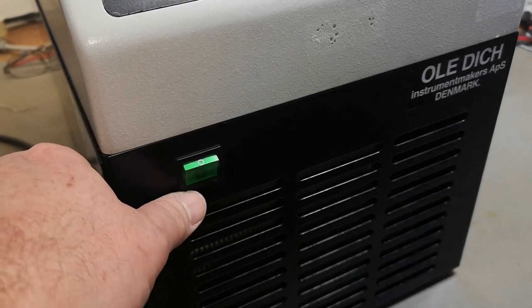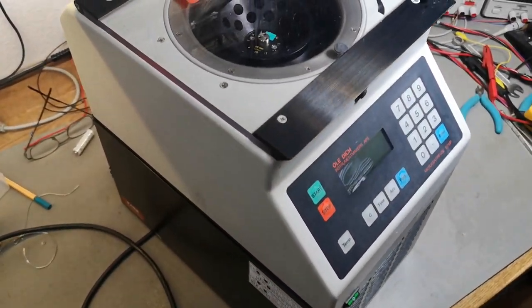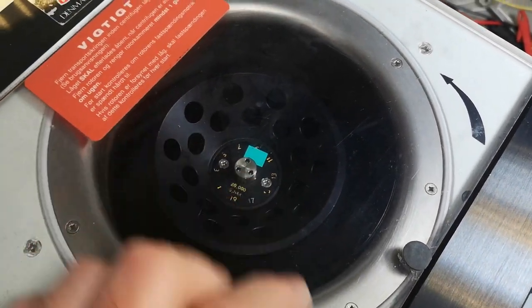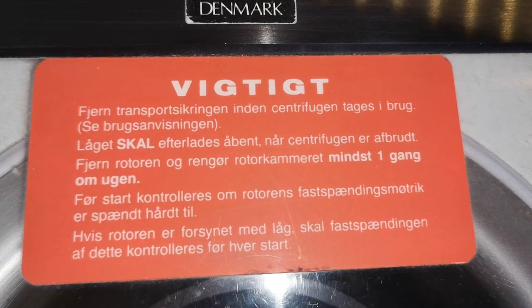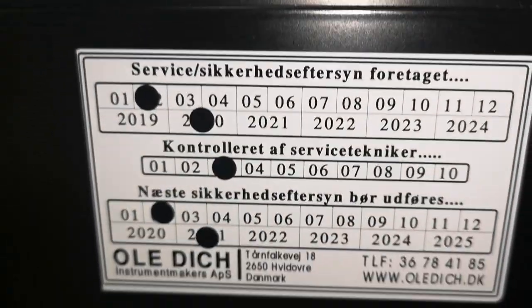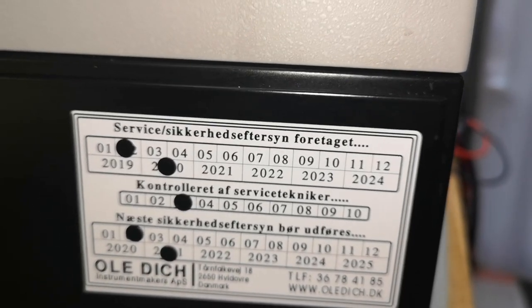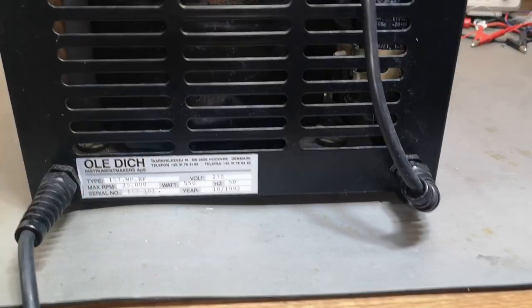That switch is probably just left on purpose. Let's have a look at the back. That is the thing that rotates with all your different samples — super cool. We also got some important warning messages about what to do when transporting the unit, and a safety checkup done around 2020. This unit was found in a trash can — a dumpster dive.